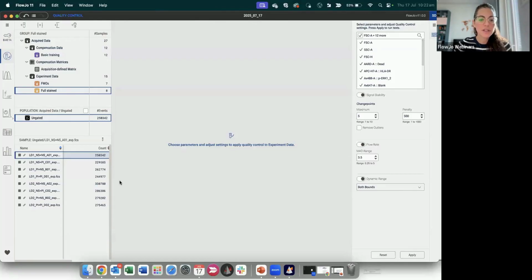Okay, it's just, this zoom bar is really, really annoying. So I can quality check my data, and we strongly suggest you do that because we don't want to end up analyzing data that are actually artifacts or something that is wrong. Sometimes you may have some fluorescence anomalies, and these could actually corrupt your final analysis.